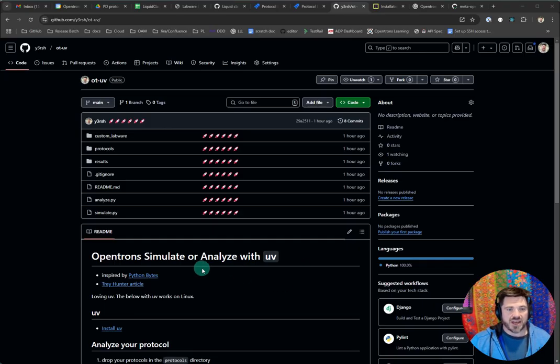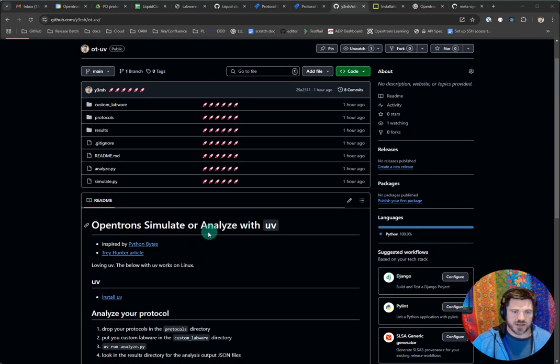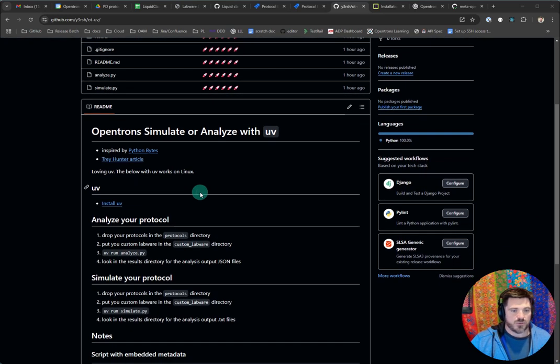I've tried to make that easier using a tool that's become very popular in the Python world that manages your Python and dependencies really easily, and it's called UV. I have some links to it here in this repository that I'm sharing, and I'm going to put this video into this repository README. What you need to do is install this tool UV, and it will manage the Python version as well as the dependencies that you have.